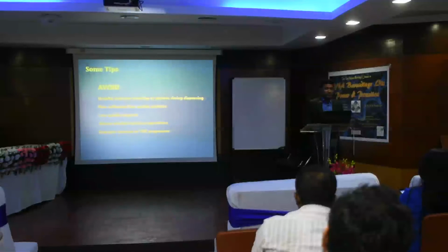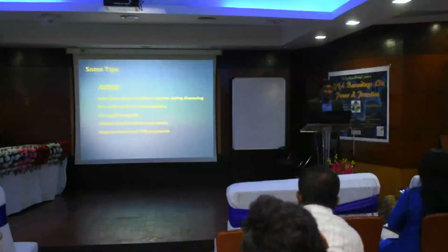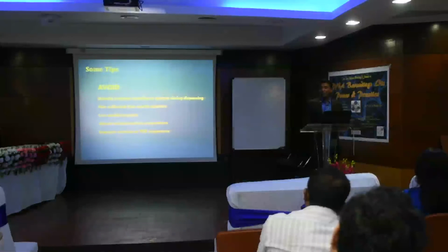So usually we recommend students to start pipetting PCR reactions early morning. When you come to the laboratory, do it. So you are fresh enough, no hunger. In the afternoon, what happens? Your lunchtime. The rush is too much because other people start eating, so you want to finish quickly, and mistakes will happen. In the evening the same thing happens.